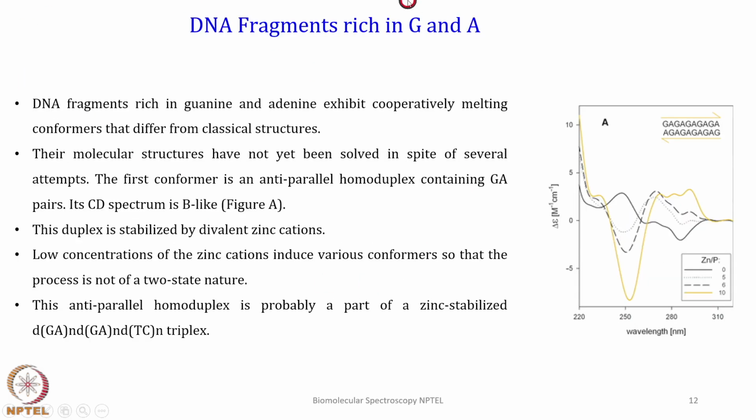Now, for DNA fragments rich in G and A, how can you find out if your DNA is rich in G and A?